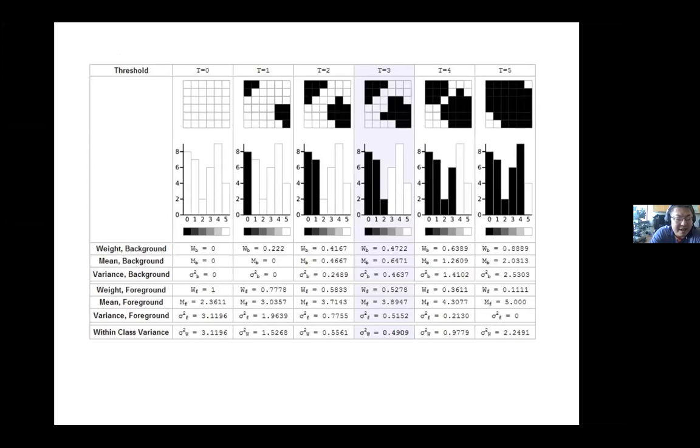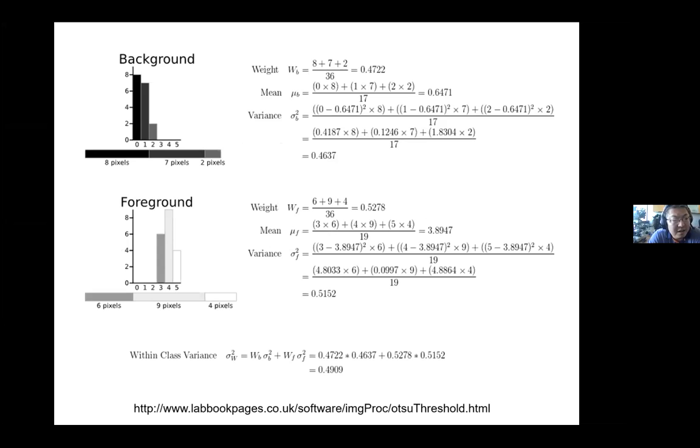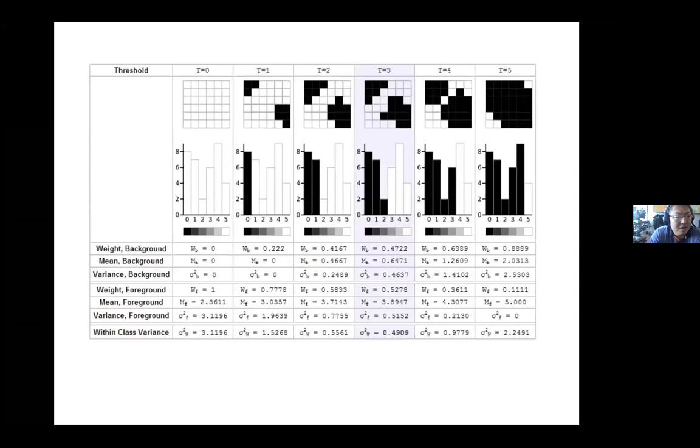So basically, their idea is: I find a thresholding value to divide this into two groups, and those two groups are very close to each other. That means this value is small. So basically, we try to find the thresholding value to divide all the pixels into background and the signal, and those two are very close, very similar to each other. In that case, we think we found the best separation. So this is how they do it. Ready?